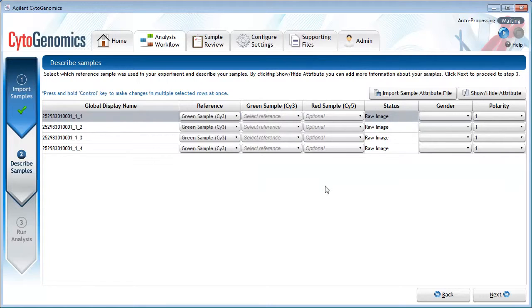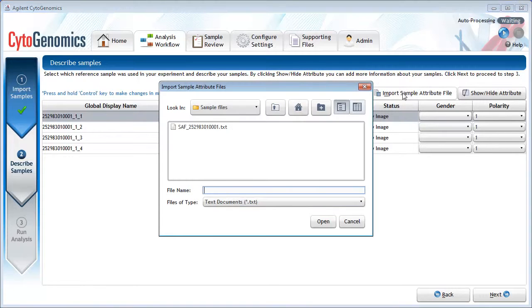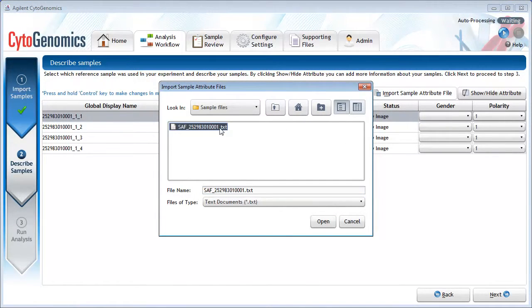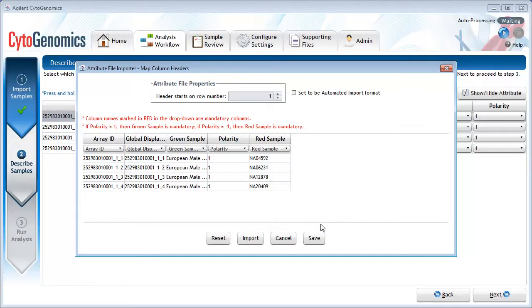When describing your samples, you can assign attributes individually or you can import a sample attribute file that contains the information in a tab-delimited text file. For that approach, click Import Sample Attribute File and select the file to import. This dialog box shows you how the program will map the columns in your file. If the mapping is correct, go ahead and click Import.